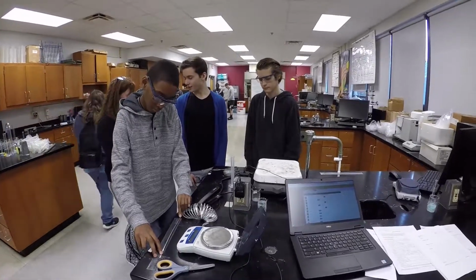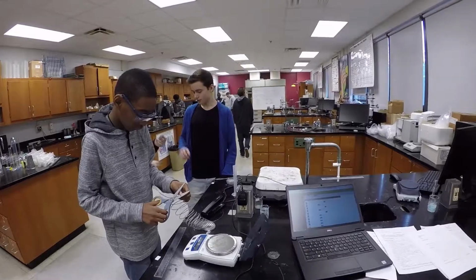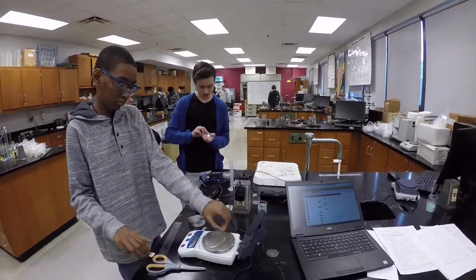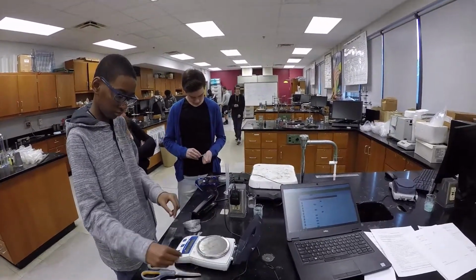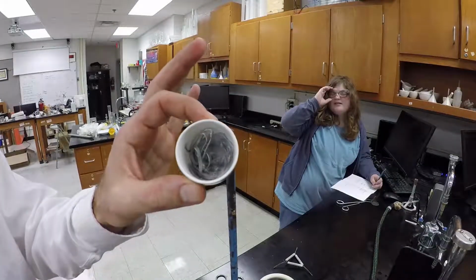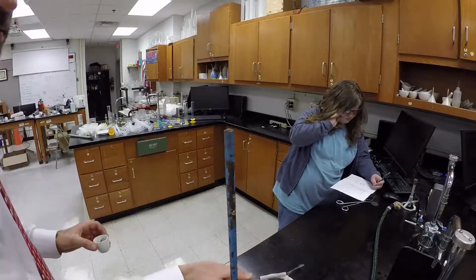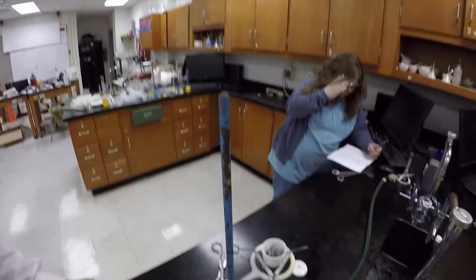Now you will also have to bring over your clean crucible and place it on the balance. You'll need to know the mass of that because when you burn it, the ash will be in the crucible. I would recommend only bringing over the bottom part because the top part could fall off and break, and that would create a problem. So I only measure the bottom. The crucible looks like this. And then we're going to place it on the triangle and we're going to light it.